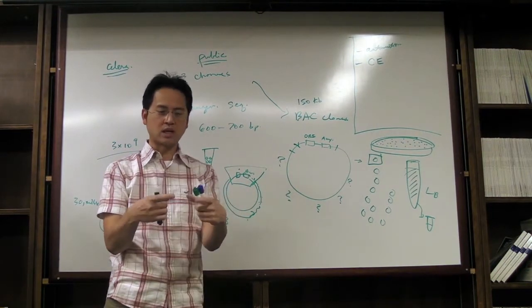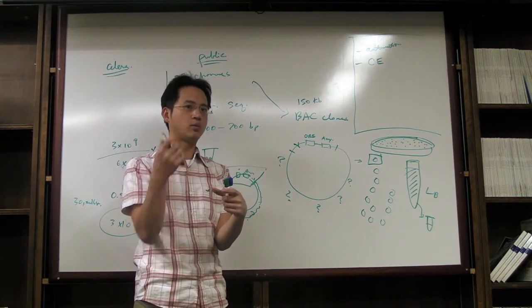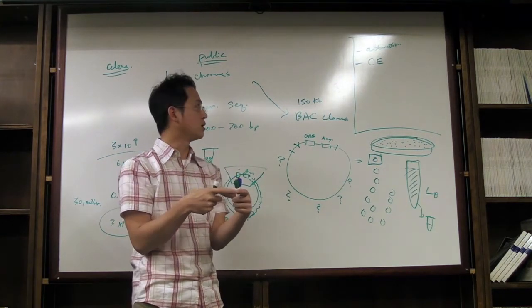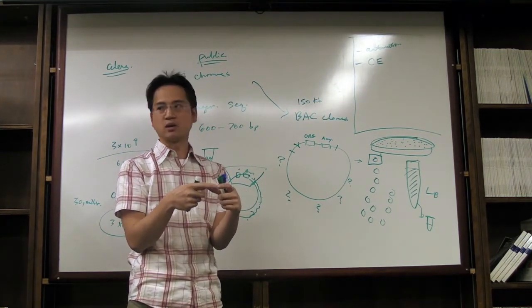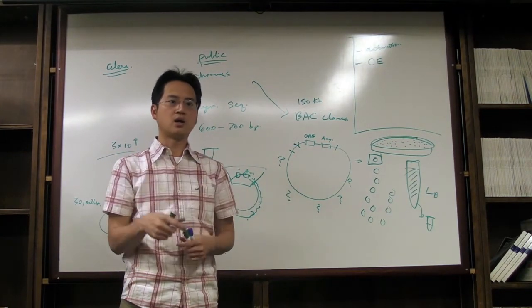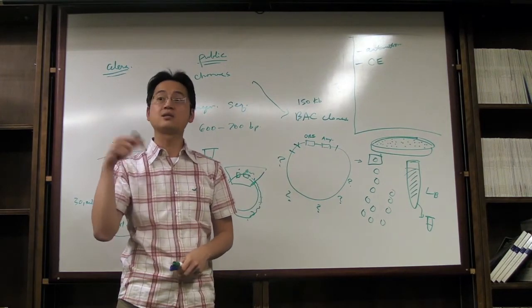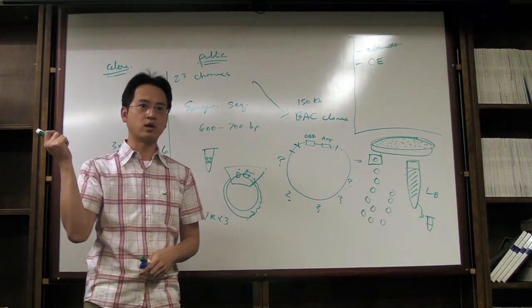They start with slab gels, I think, but still a little bit more automated, and they probably incorporate fluorescent-tagged nucleotides. But then eventually it got into the capillary, where you can actually do 24 reactions or 48, and I think at some point they used the 3730XL, not what we have, which is the 48-well capillary.